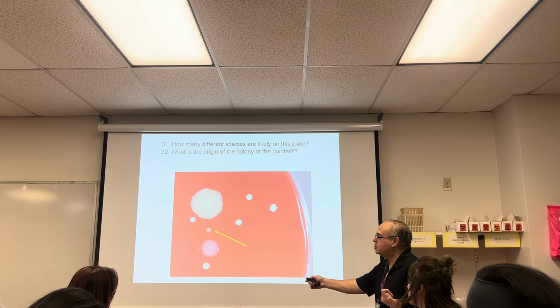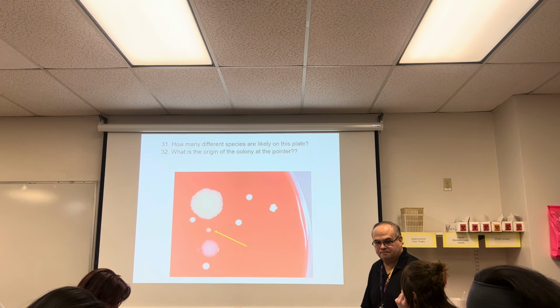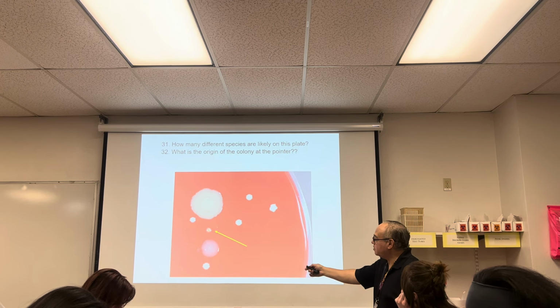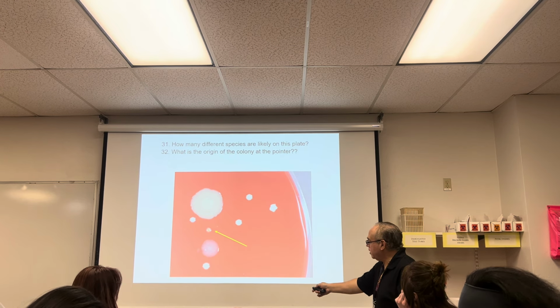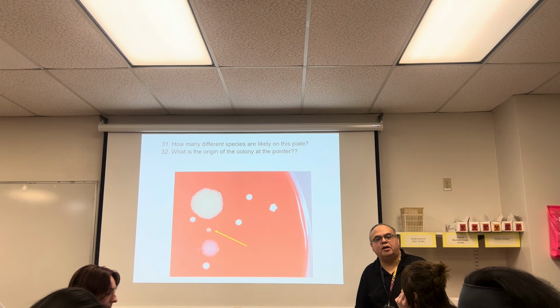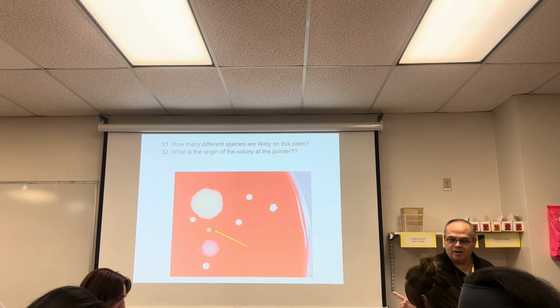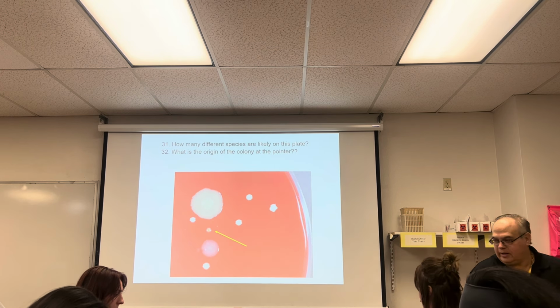No, that doesn't have any true shape. Those are just crystals of something. This one has a nice round shape. The others don't, right? They're all kind of goofy looking, right? So they're smudges, and they're probably going to be salt crystals. Okay? But if you don't identify that rule, you're okay with that.